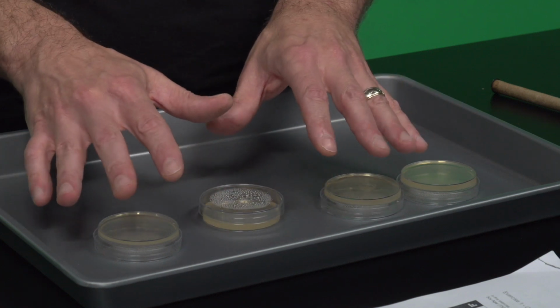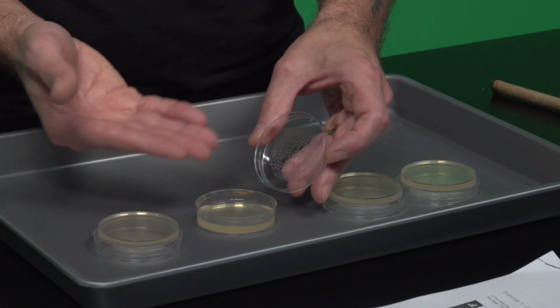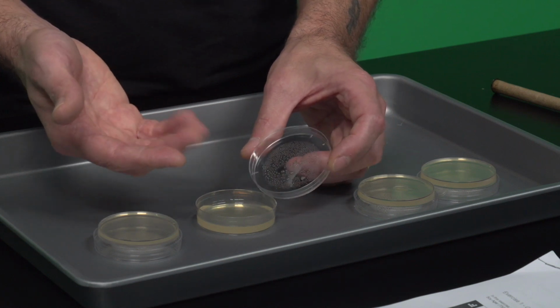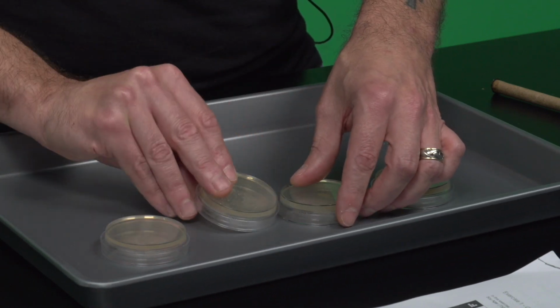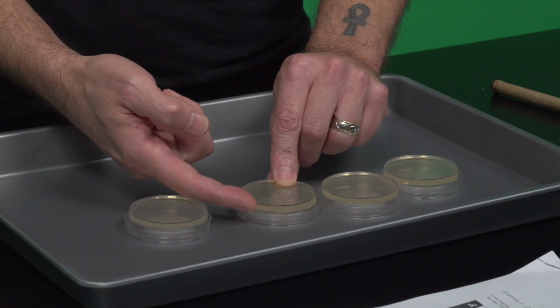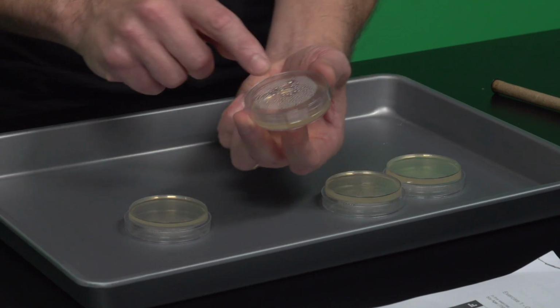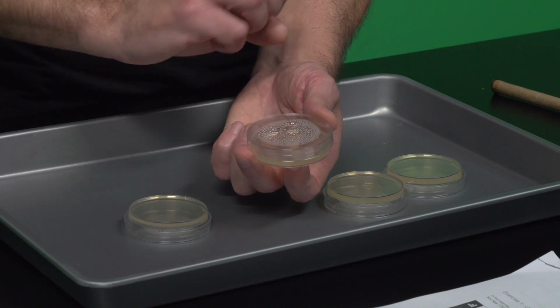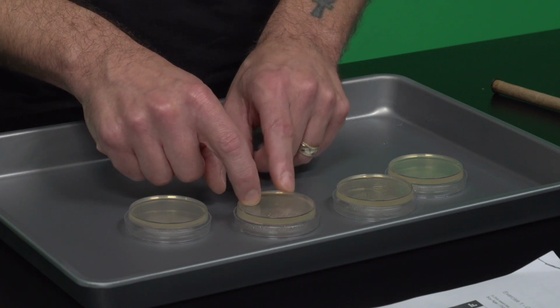Another thing I'll bring up right now is that for the purpose of instruction, I will often open up a plate and show you, but you don't want to be doing this because right now microbes can be falling onto the plate from the environment, all right? This is just so that I can show you certain things. In general, always keep them closed, and when you can, keep them all upside down. Upside down means that the agar is on the top and the lid is on the bottom. The reason we do that mainly is so that condensation does not drip down, land onto the surface of the plate, and spread out your bacteria, because what you're going to be doing with these plates is trying to isolate individual colonies.